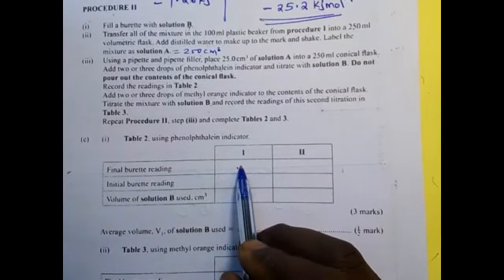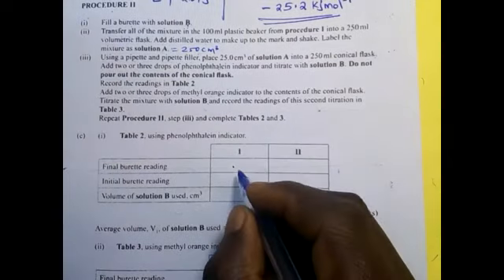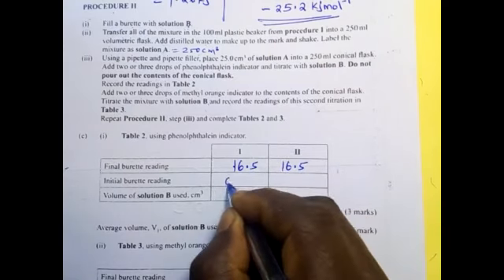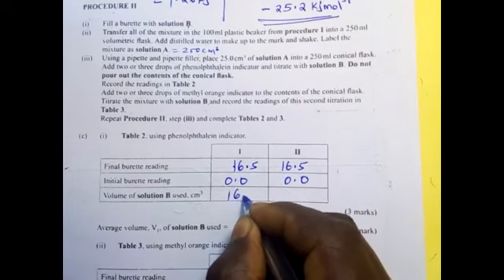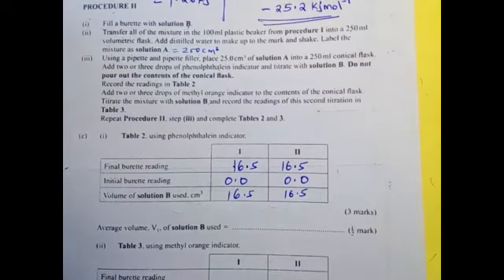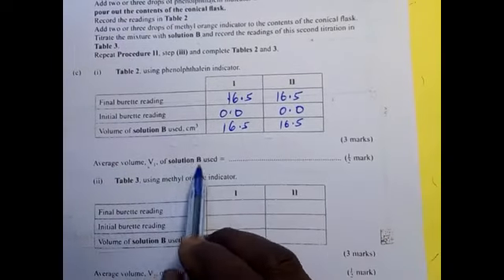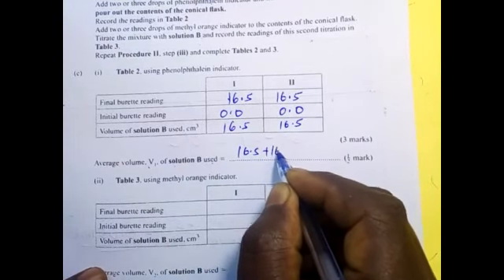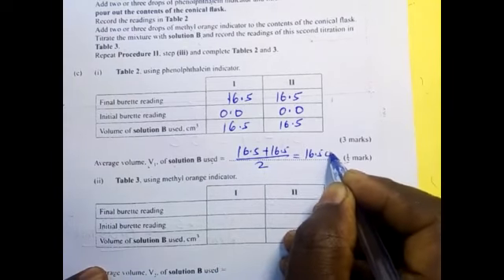So let us see what we are going to fill in the table. Let us use these values: 16.5. Our initial is 0.0, 0.0, and then our final is 16.5, 16.5. So the average volume of solution B used here: 16.5 plus 16.5 divided by 2, which will give you 16.5 cm³.